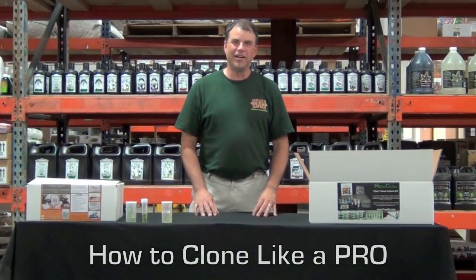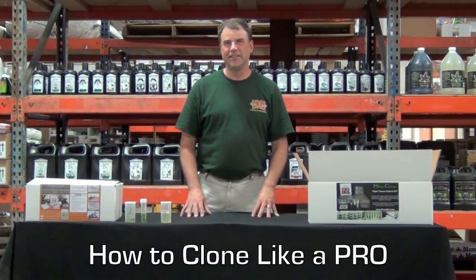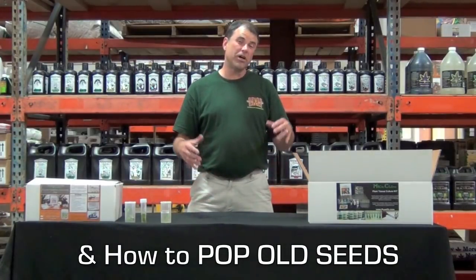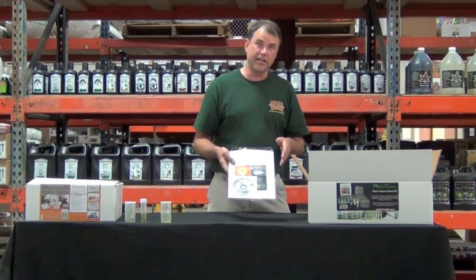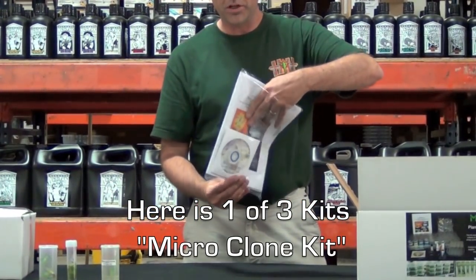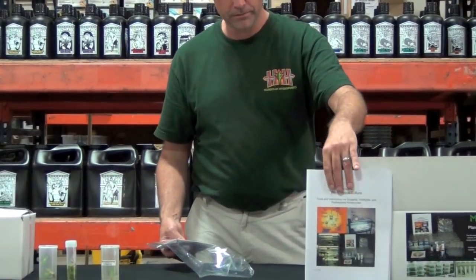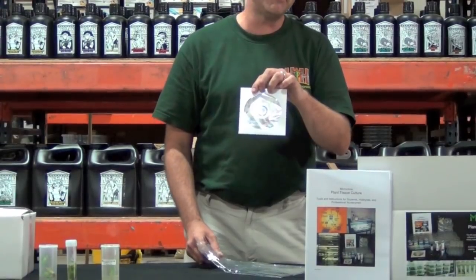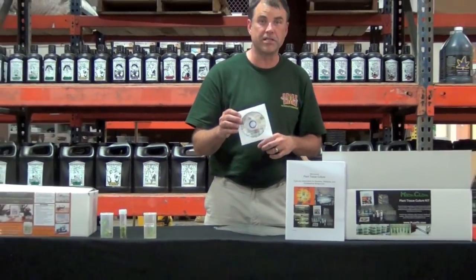Hello, my name is Bill Graham. I'm the maker of the MicroClone and SuperStarts Plant Tissue Culture Kits. We are at Monster Garden in Ronan Park, and I wanted to show you the contents of the tissue culture kits. This is the manual for the kit and the DVD. The DVD will have all of your procedures inside. A lot of the videos, in particular the mixing videos, have been updated online, so if you're watching this, look for tissue culture mixing videos.